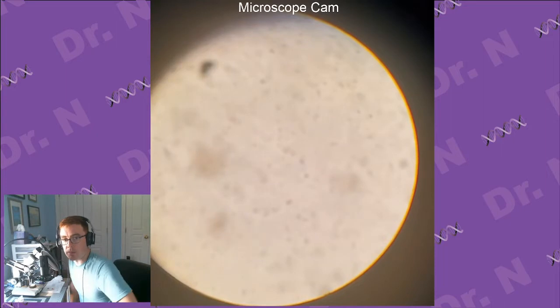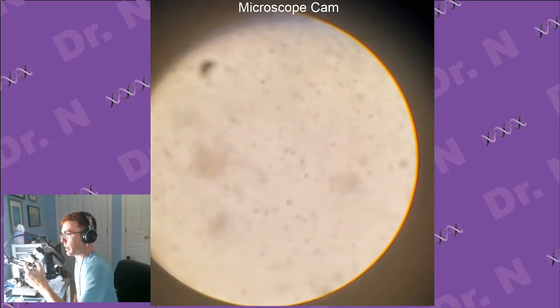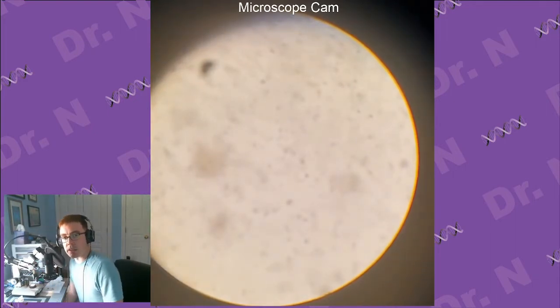So the point of today was I was going to grab out my microscope and try and get some DNA on screen. So I have some preserved samples. I don't really know how well preserved they're gonna be, but I'm gonna try it nonetheless to see if we can grab out some DNA from them.